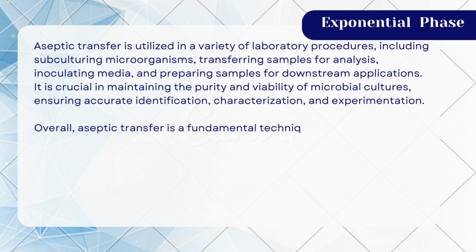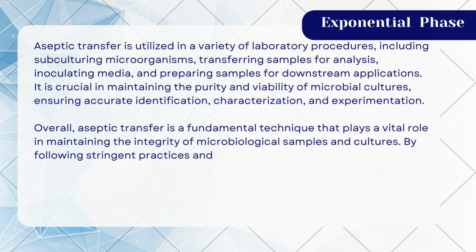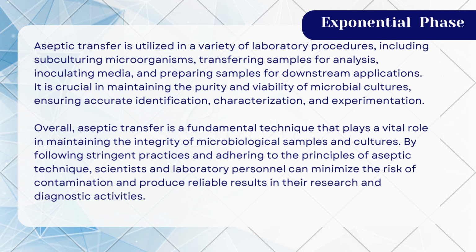Overall, aseptic transfer is a fundamental technique that plays a vital role in maintaining the integrity of microbial samples and culture. By following stringent practices and adhering to the principles of aseptic techniques, scientists and laboratory personnel can minimize the risk of contamination and produce reliable results in their research and diagnostic activities.